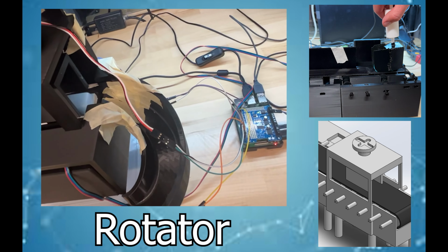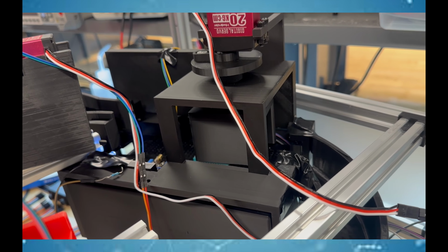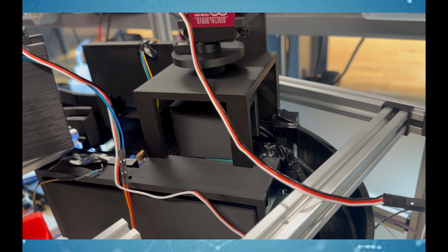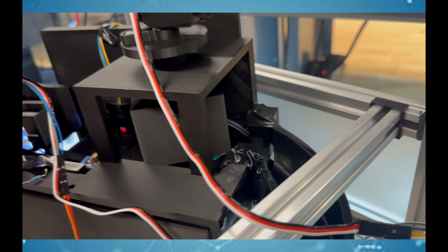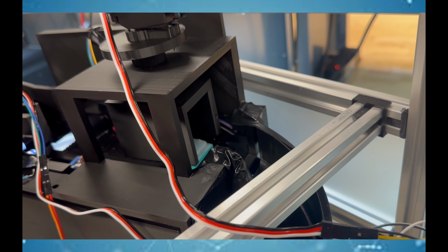Our rotator went through fewer iterations compared to the other prototypes, but still involved necessary testing to see if rotating on the TPU conveyor belt was possible. Our final version was fully integrated with the working conveyor belt and has performed the necessary tasks we needed. Other parts in our system experienced the same types of prototyping but involved more iterating to integrate electronic and hardware components best.